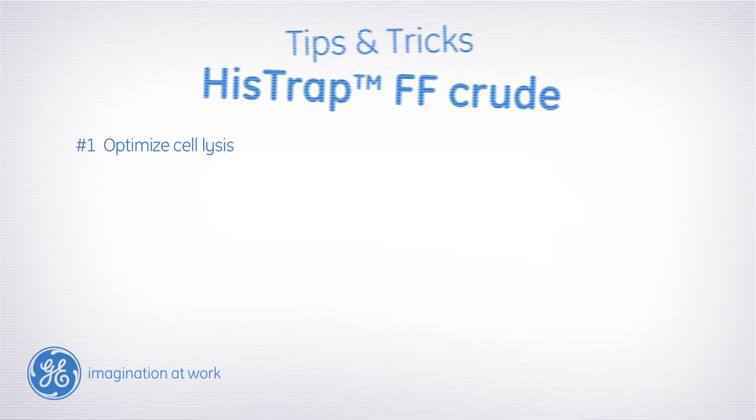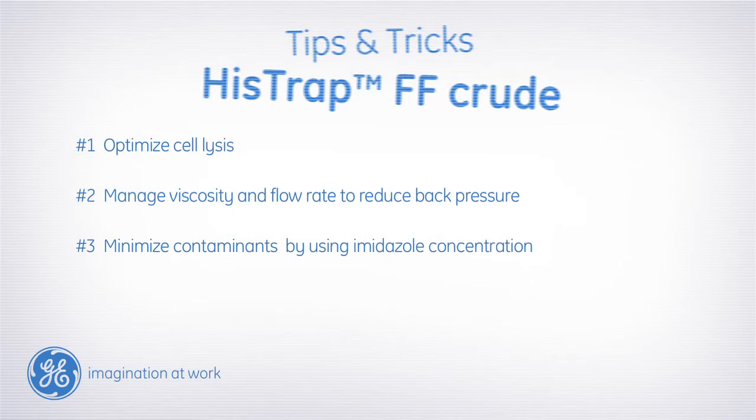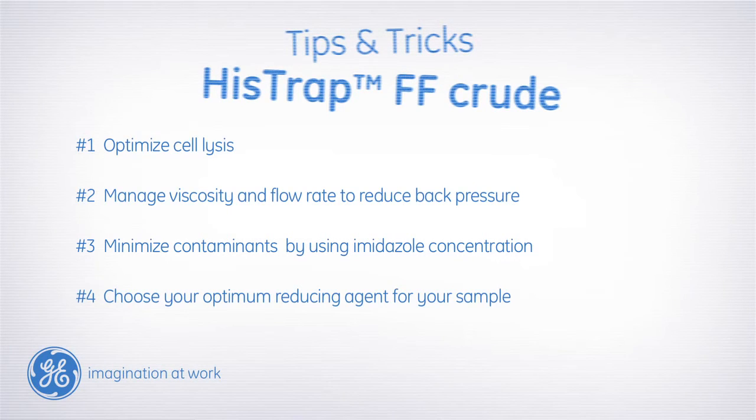1. Optimize cell lysis. 2. Manage viscosity and flow rate to reduce back pressure. 3. Minimize contaminants by using imidazole concentration. 4. Choose the optimum reducing agent for your sample.